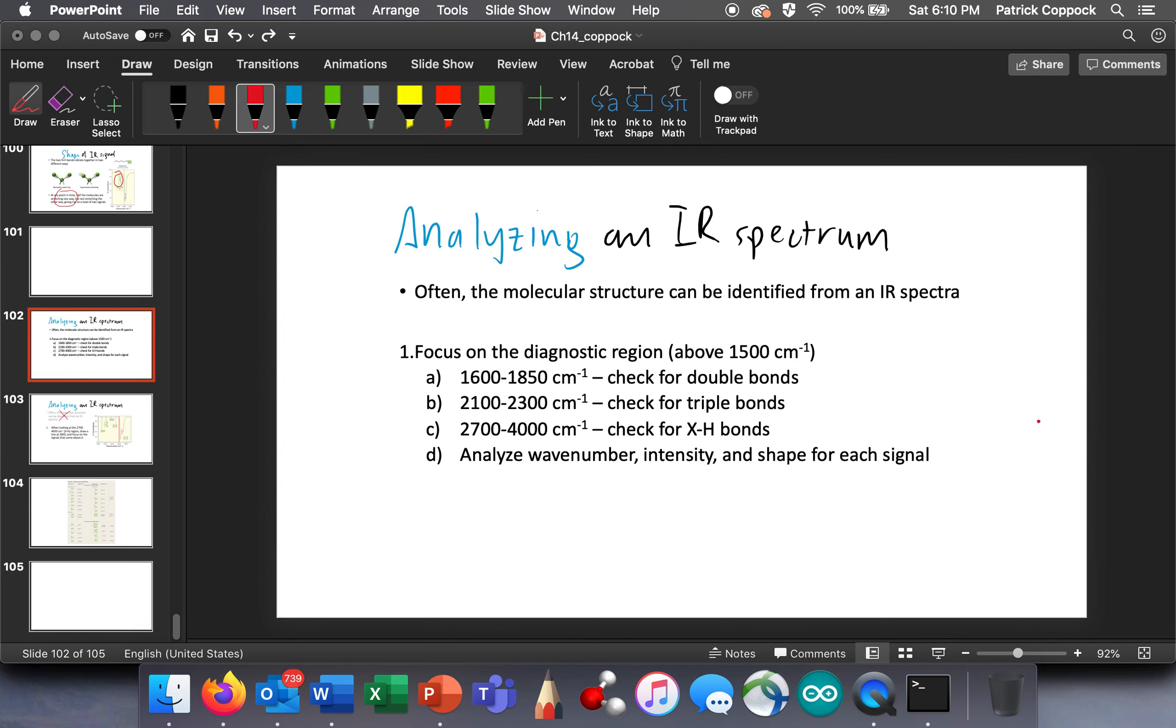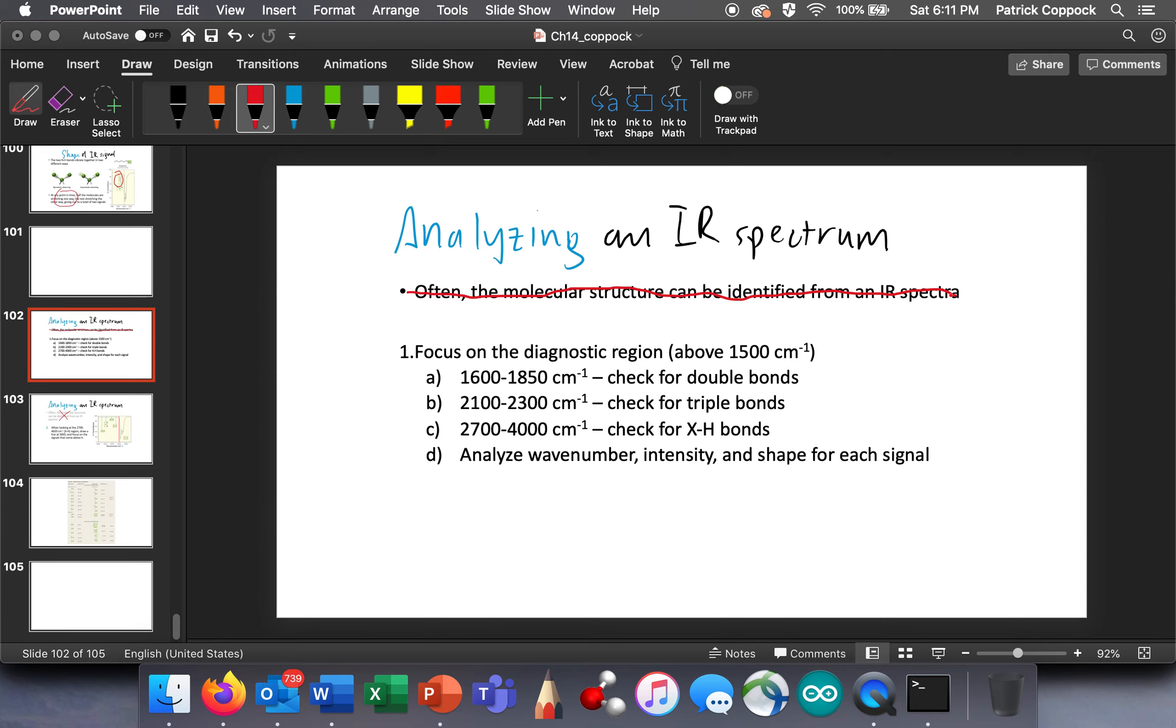Okay, so it's time to put it all together. Let's talk about analyzing an IR spectrum. The author of our textbook makes a claim with which I'm going to humbly disagree. He says that often the molecular structure can be identified from IR spectra. And I'm going to say that may be true for a professional chemist, but for us, and I don't mean you can't handle it, I'm only saying this is an introductory class, we are going to be using spectra to gather information to put with other information to identify compounds.